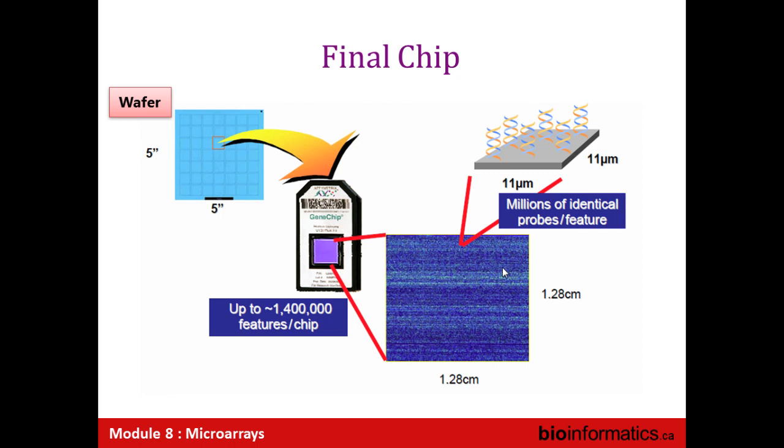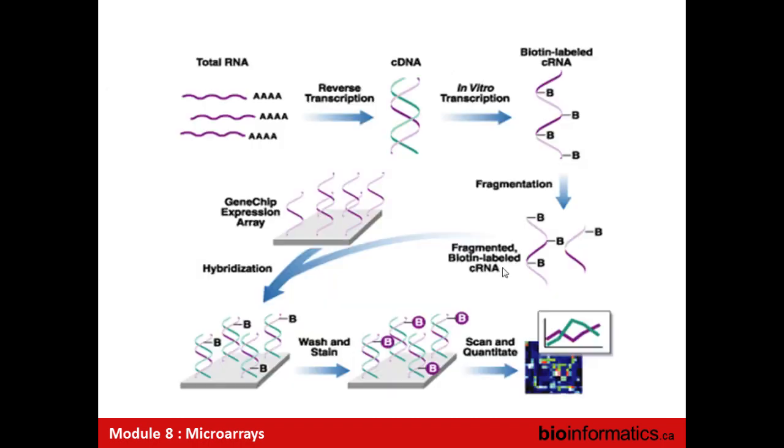Okay. So we have the Affymetrix chip. We have the chip itself, and we have features on the chip. The next thing we have to consider is what we do with it. The context of an Affymetrix chip, it's a little unusual. And this is a great trick question to ask students at committee meetings and things, because most people don't realize that Affy chips and photolithographic chips are fundamentally different in their sample prep from most other chips.